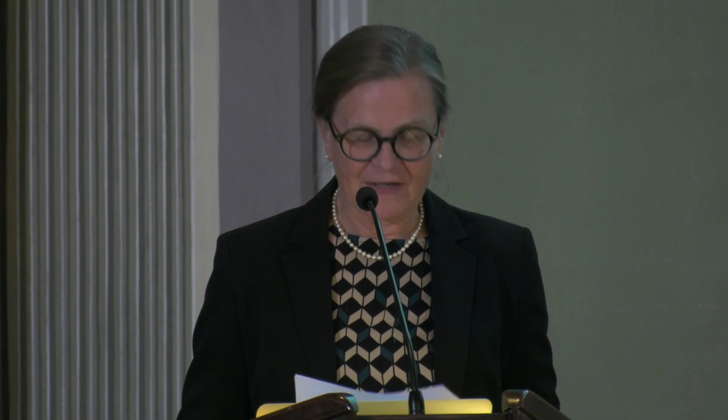Today we focus on pioneering achievements in microscopy, and that's what this Zsigmondy lecture is named after. The Nobel Prize winner Richard Zsigmondy was an Austrian-Hungarian chemist and researcher in the field of colloid chemistry and microscopy. The Austrian Academy of Sciences is old enough that we can claim also people who were part of the Austrian-Hungarian Empire. He received the Nobel Prize in 1925 because he developed an ultramicroscope, a special version of a dark field microscope, where already in 1912 they could see 4 nanometer sized particles by looking at the light scattering.